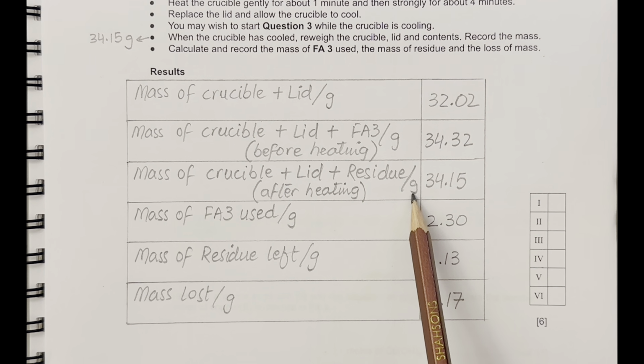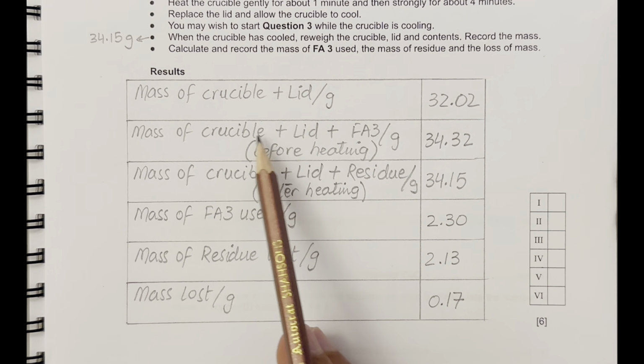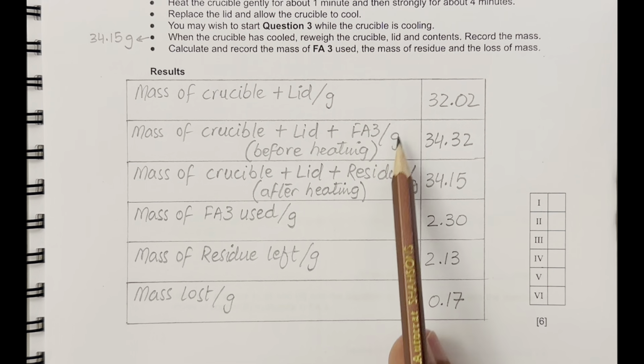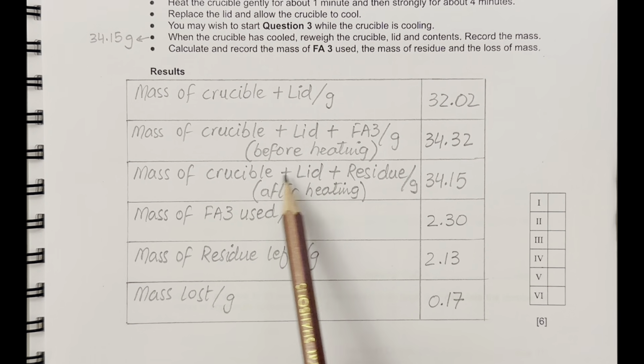In this way, you can easily calculate the mass of FA3 used. How? By subtracting the mass of crucible and lid from this, which is the first value. So subtract the first value from this value, you will just get the mass of FA3 used. And when you are to calculate the mass of residue, you can just subtract the mass of crucible and lid from this mass.